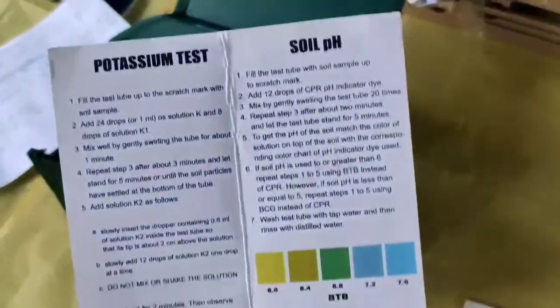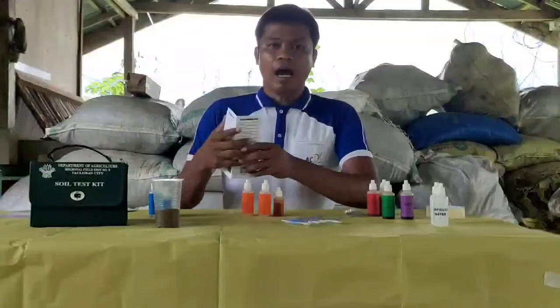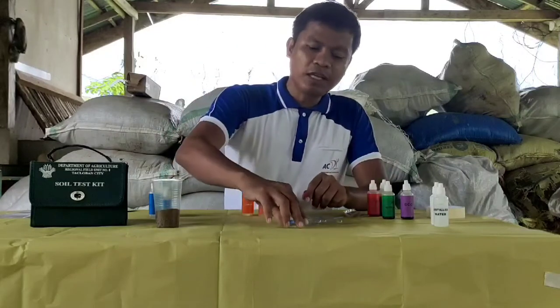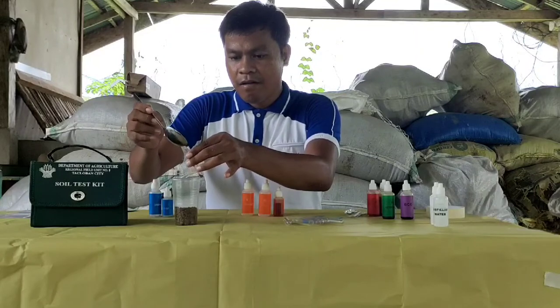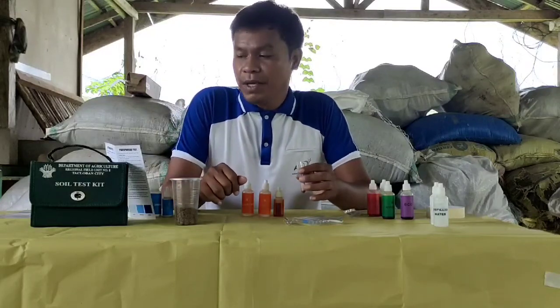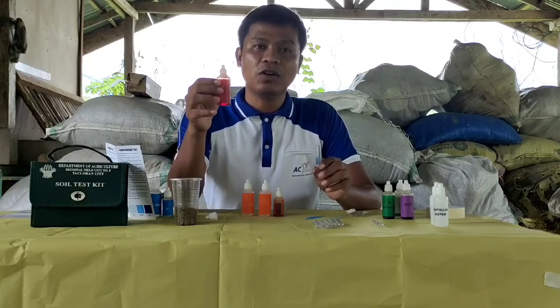Dito, may 12 pH indicator. Kung high ba siya or low yung pH. Ito rin mga nitrogen test, phosphorus test, at saka potassium test. Ang una nating gagawin ngayon ay ang pag-analyze ng lupa through soil pH. Mayroon tayong test tube. Lalagyan natin ng lupa — soil sample. Lalagyan natin ng 12 drops of CPR indicator dye. Ang meaning nito ay chlorophenol red. Ito ay nagsisilbing pH indicator dye to measure our soil pH.